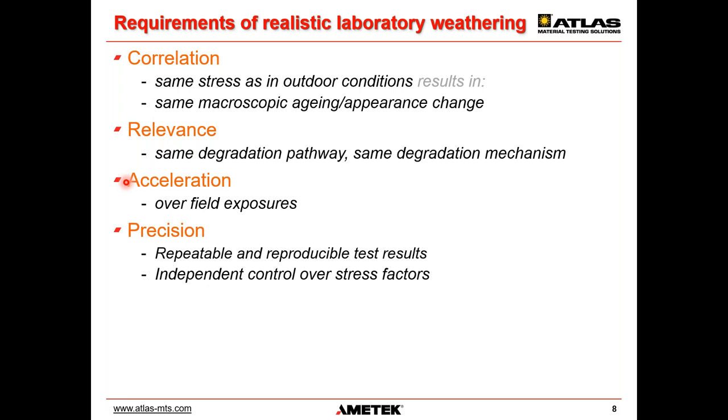And acceleration. As I said in my introduction, we always focus on test methods that deliver test results after the shortest possible time. And that's what we cover in a separate webinar, where you see all the different ways of acceleration. But what's typically done in test methods, just as an introduction, is that they work on realistic maximum levels for irradiance, temperature, and moisture, and also on time compression. So they neglect the night cycles, or only do short versions of dark periods, so that we have a lot of radiation time, which is typically dominant and provides acceleration.